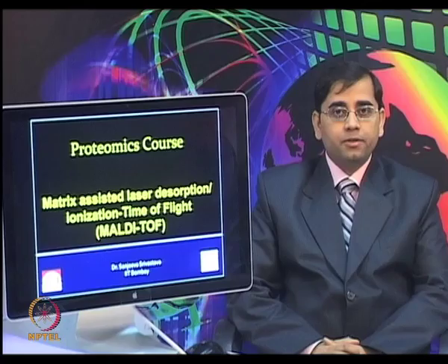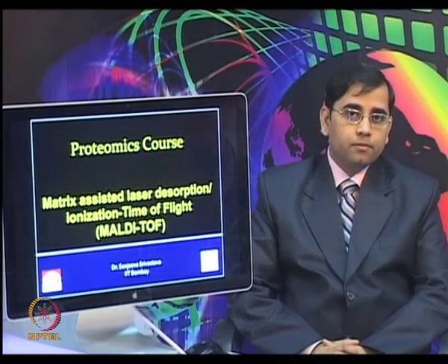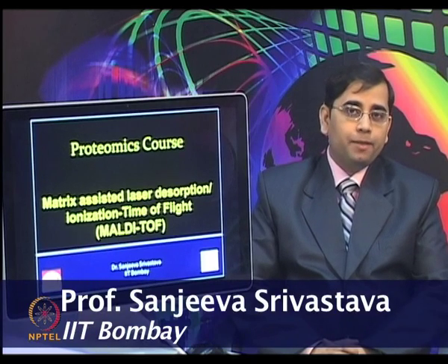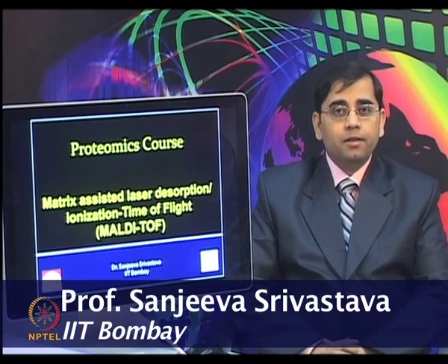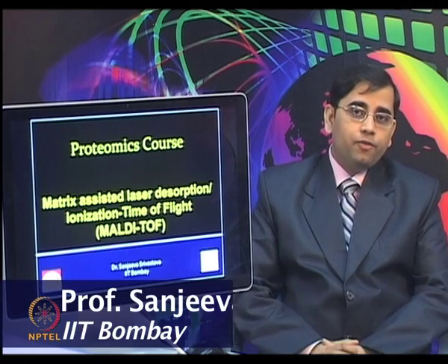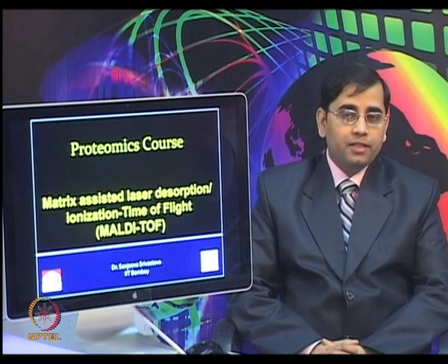Today we will talk about matrix assisted laser desorption ionization time of flight, MALDI-TOF. In the previous lecture, we talked about the basics of mass spectrometry, the various combinations of mass analyzers and ionization sources. Now, it is time for us to combine those and start discussing these in more detail.